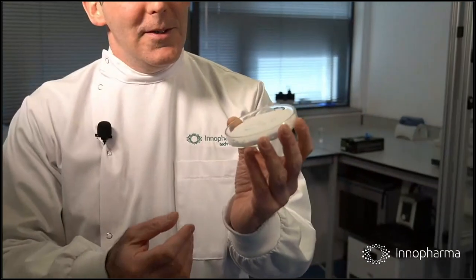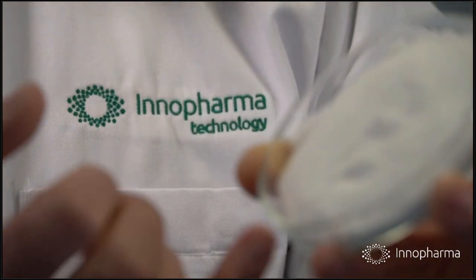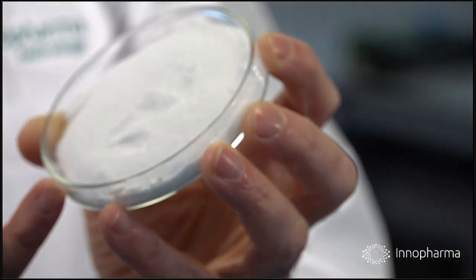So we've already discussed the final yield. But what I wanted to show you was the results of our crystals. If I could have those crystals there from today's experiment. I think they're still on the mass balance over there. Yeah, please. I wanted to show you the results of our experiments, our process run today. So we have very fine grains, just as in the previous sample that I showed you, very fine powder that has very good flowability. So why is it? Oh, here, I better help you out now.